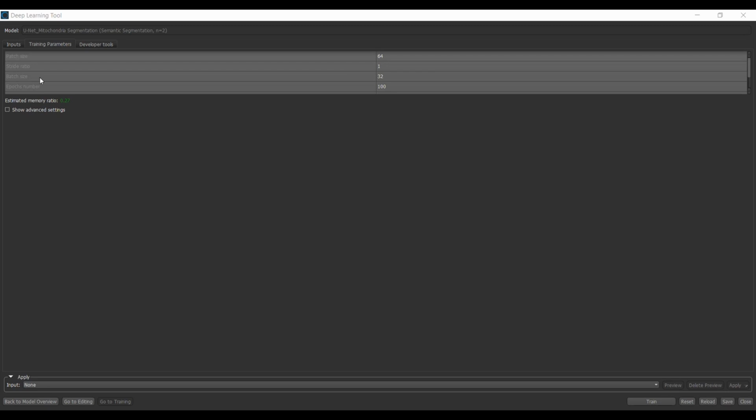And then batch size. Batch size in the sense like the number of patches you're feeding for training the weights. After each epoch it updates the weights, so epoch number, and the loss function, and optimization algorithm. There is a list of optimization algorithms, so I'm gonna set that as default.